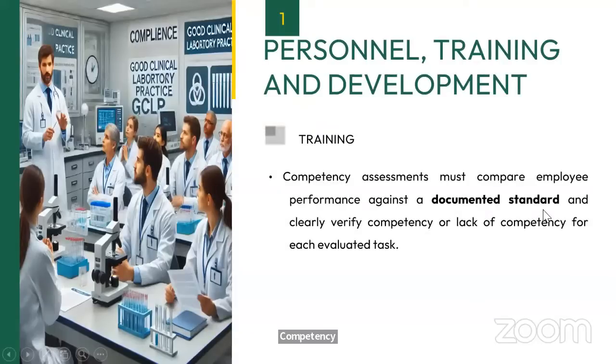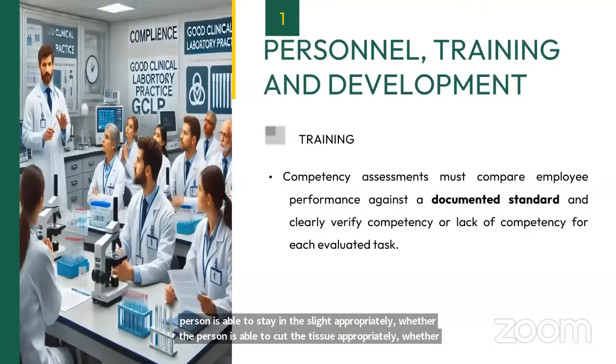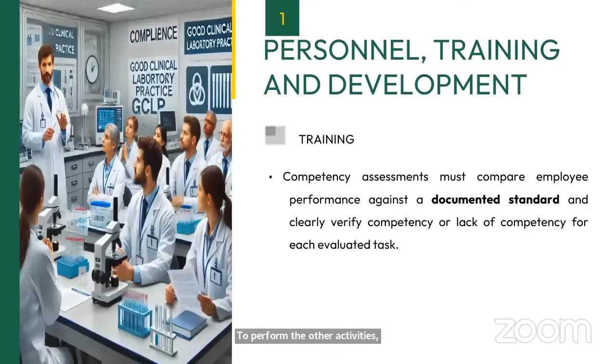So how are we going to perform the competency assessment? You should have certain predefined, specific criteria. For a person working in histopathology, for example, what will be the criteria? Whether this person is able to stain the slides appropriately, whether the person is able to cut the tissue appropriately, whether the person is able to perform other activities like typing of the report appropriately. So there should be specific predefined criteria, and as per those predefined criteria and documented standard, the competency examination should be performed.